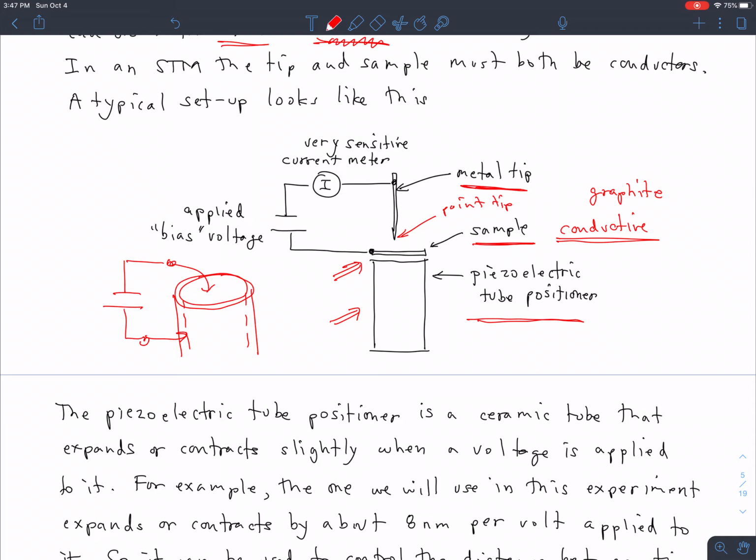Lots of voltages in these high-resolution microscopes. And as a result of that voltage, the thing that's unique about these materials is that they're piezoelectric, which means that if you squeeze the material, they generate a voltage, but it also means in reverse, if you apply a voltage, then they expand or contract by a very small amount. And so if you apply a voltage between the inner and outer electrodes on this tube, then this tube can stretch a little bit. It doesn't stretch very much. It stretches by a tiny amount that you can't even have any chance of seeing with your eye, but it does stretch a little bit, and that's exactly what you want.